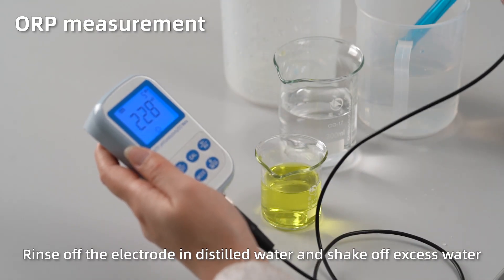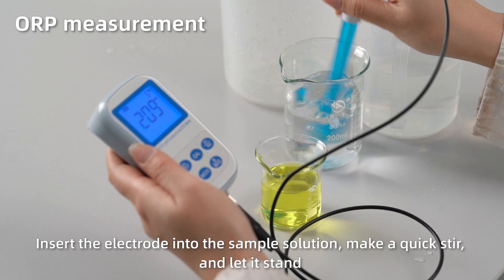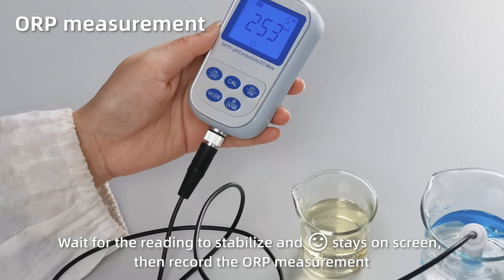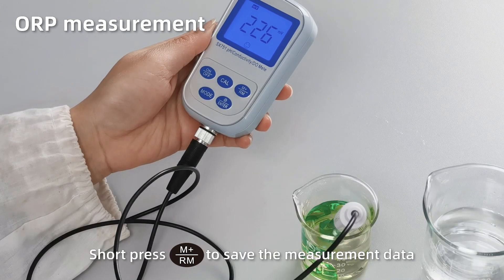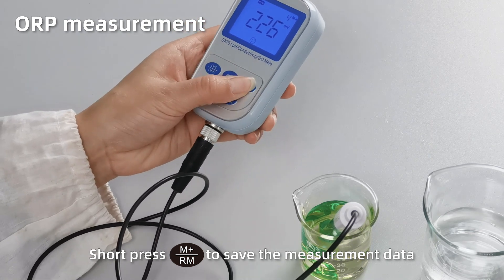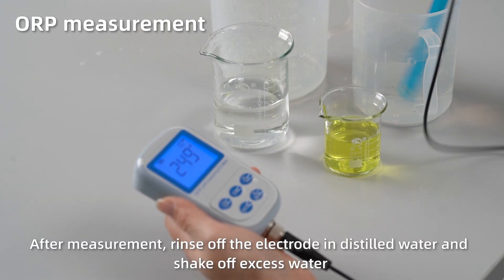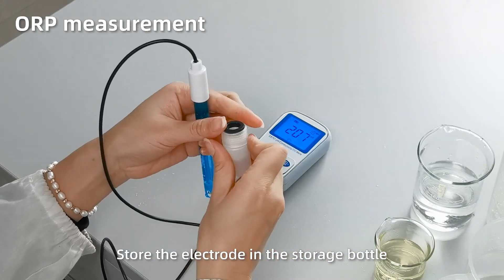ORP measurement. Rinse off the electrode in distilled water and shake off excess water. Insert the electrode into the sample solution. Make a quick stir and let it stand. When the reading gets fully stabilized and the smiley face stays on screen, short press M+ to save the measurement data. After measurement, rinse off the electrode in distilled water, shake off excess water, and place the electrode in the storage bottle.